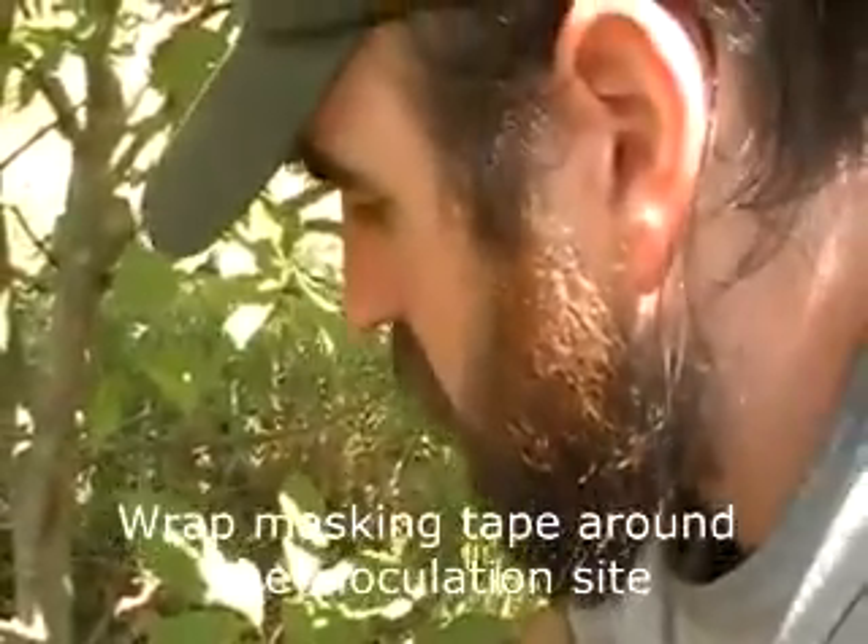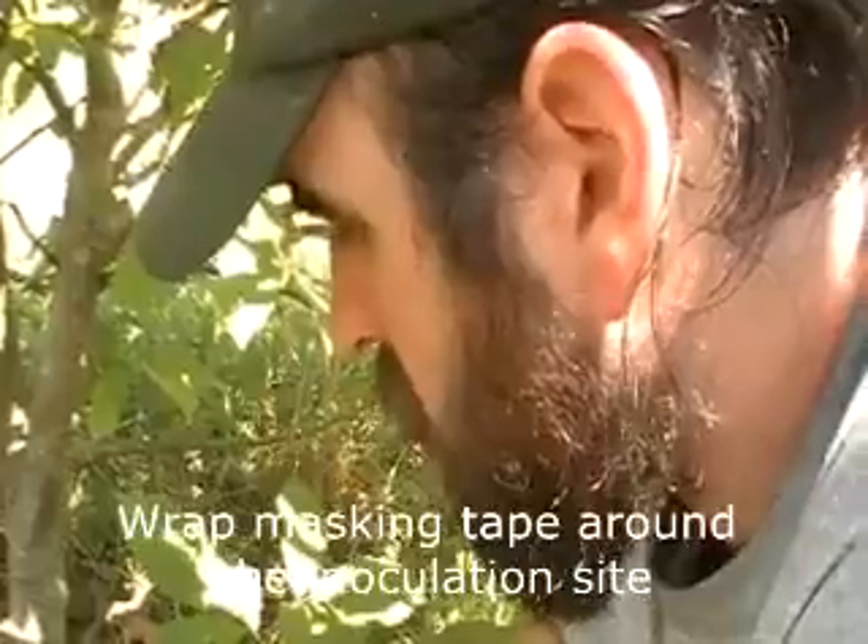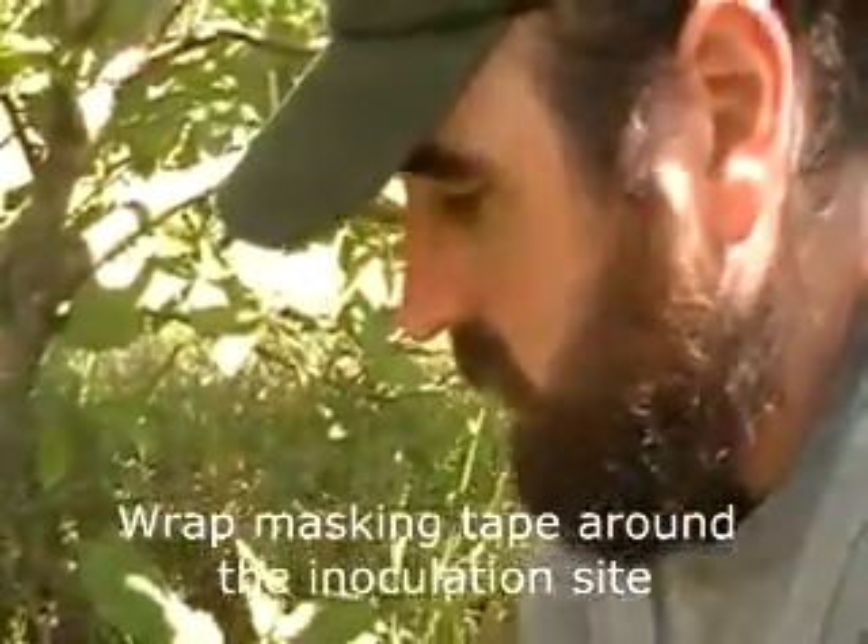Next we need to put masking tape around the cork borer holes. This does two things: it keeps the inoculum plug from falling out and it keeps it from drying up. Just one wrap overlap.